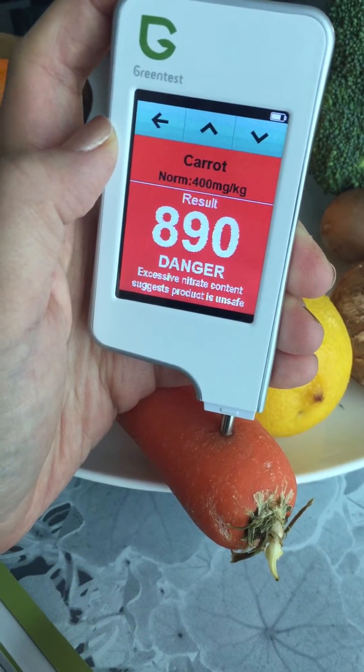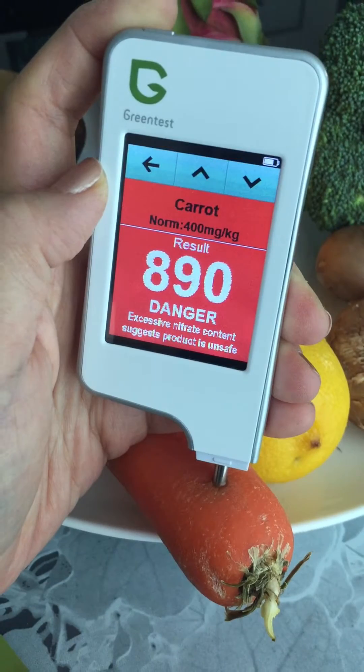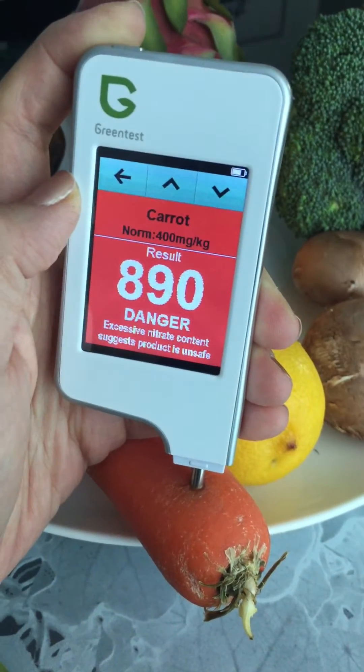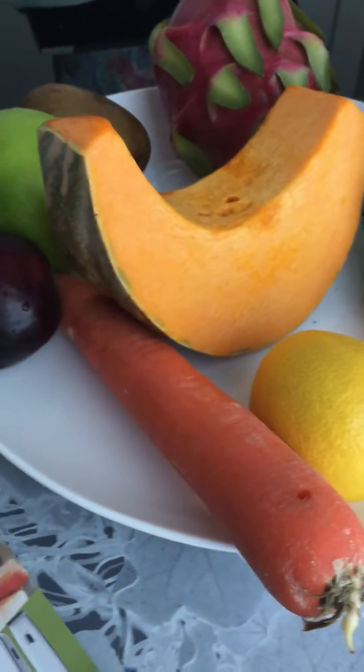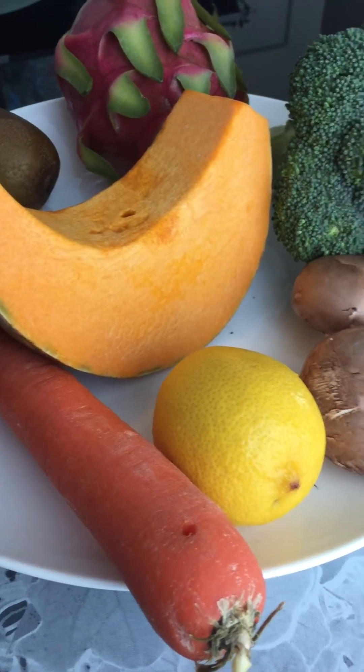The norm is around 400 — oh my god! This is a non-organic carrot and it's reading at danger level. Oh my god. Well, what should I do with this carrot? That's bad news.